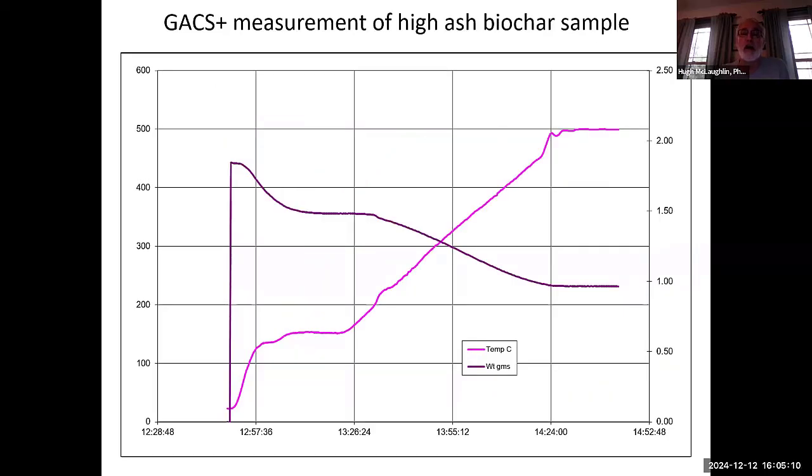This is an example of a very high ash material. You'll measure the ash content by doing the math off the two plateaus.